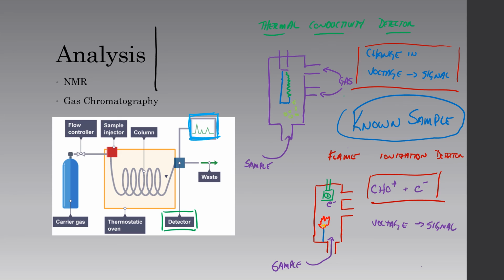So let's zoom in on here just a little bit, and let's look a little bit at what's going on. We're going to see a graph. On one side we have intensity, so our y-axis is intensity, the other one is time. Okay, so we're going to start at time 0, right? Time 0, nothing's hitting our detector. Eventually something's going to hit our detector. We see a spike. We might see another spike, right? And another spike, right? So these individual spikes are the signals from the detector that say, hey, something is coming through or changing the voltage.